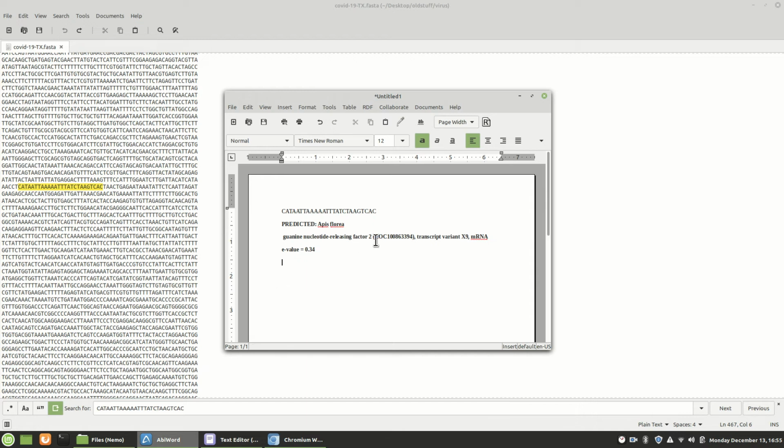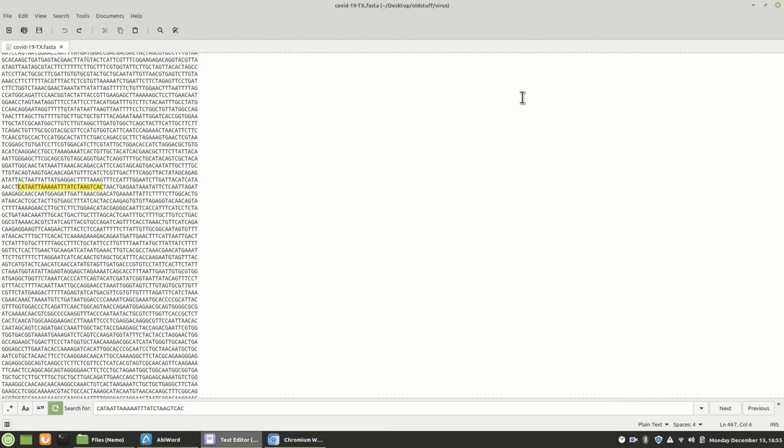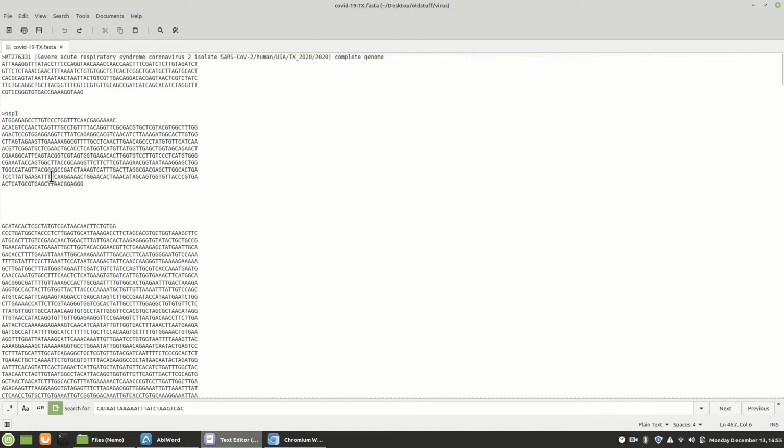Now, how are we going to deal with this having to use the smaller sequences? Well, let's go up here. I have NSP1 kind of isolated here from the rest of my sequence. And in fact, we tried in class with NSP1 and got almost nothing. So we're just going to have to take some smaller sequences. So I'm going to do it again with NSP1, and I'm going to take a much smaller sequence, like right there. And I'll do it.